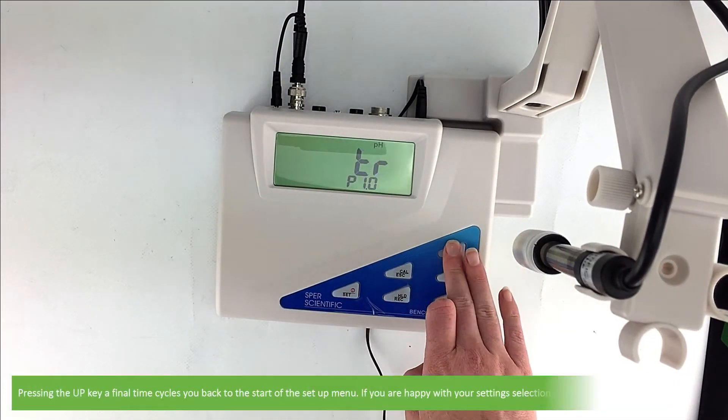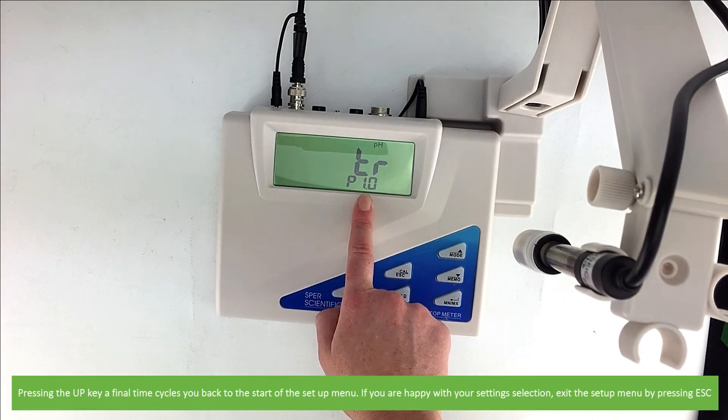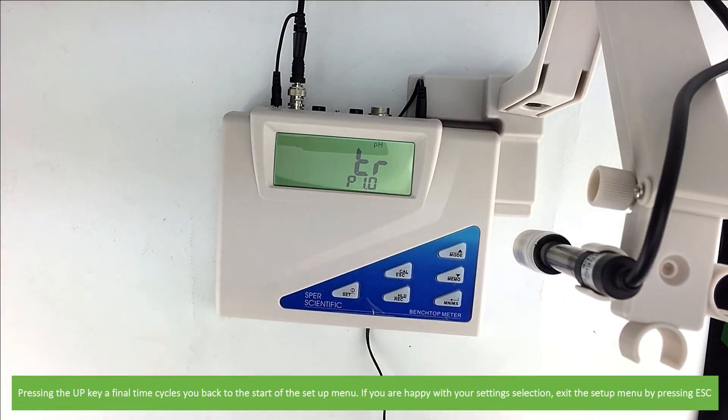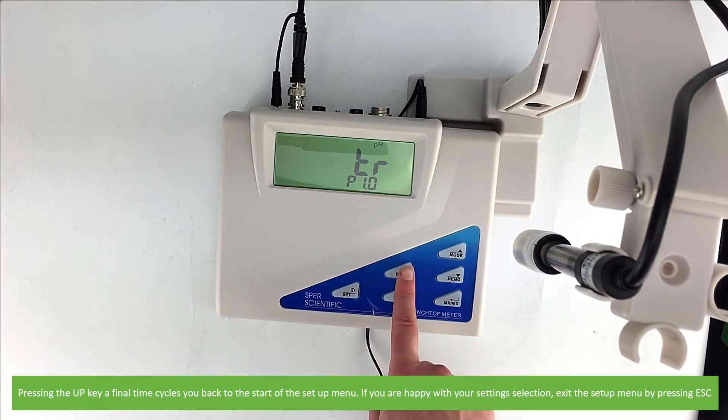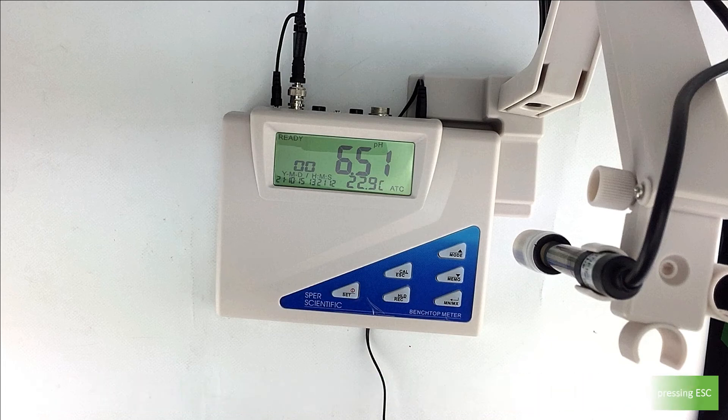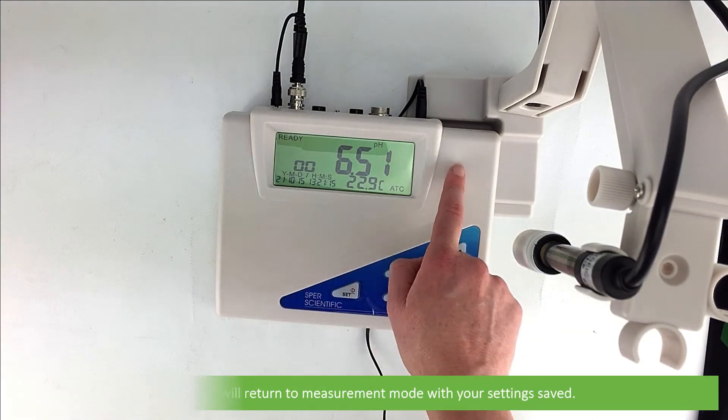Pressing up a final time cycles you back to the start of the setup menu. If you're happy with your settings selection, exit the setup menu by pressing escape. The device will return to measurement mode with all your settings saved.